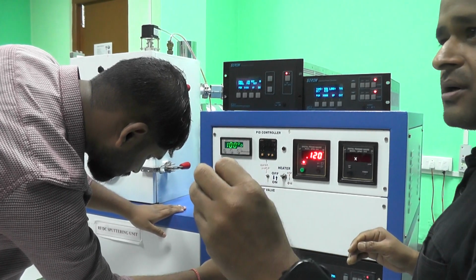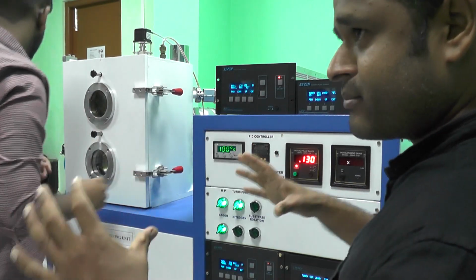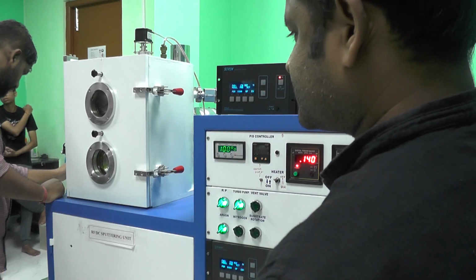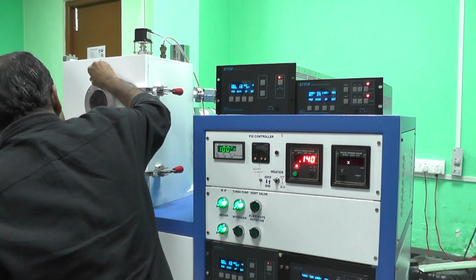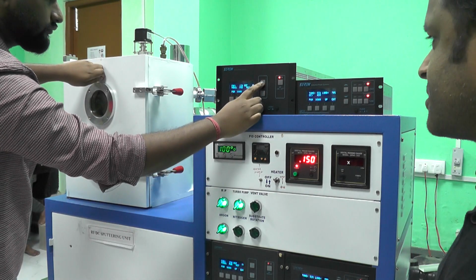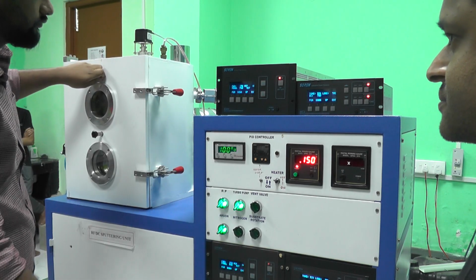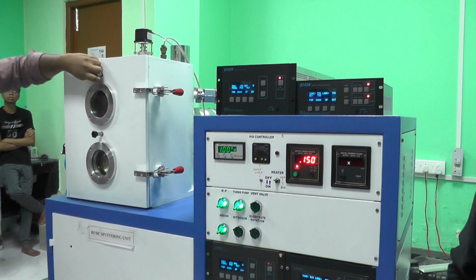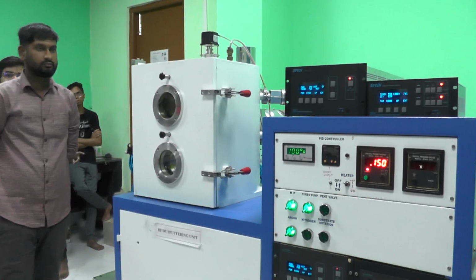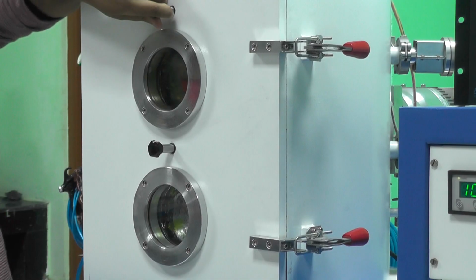Suppose we have to grow 2 nanometers of thickness, so we know how much time is required. Now you can see the plasma here. You can see the plasma.